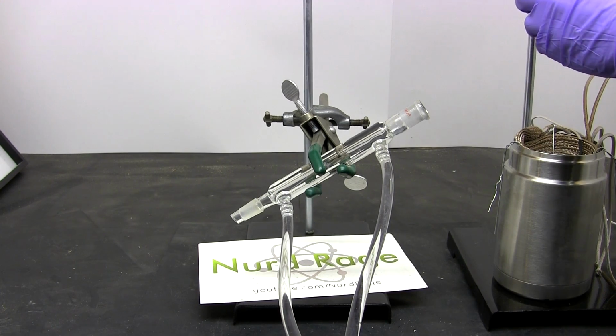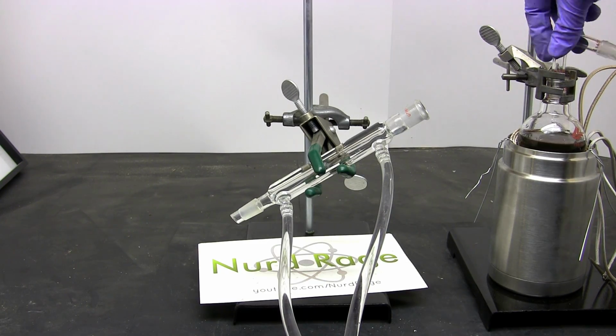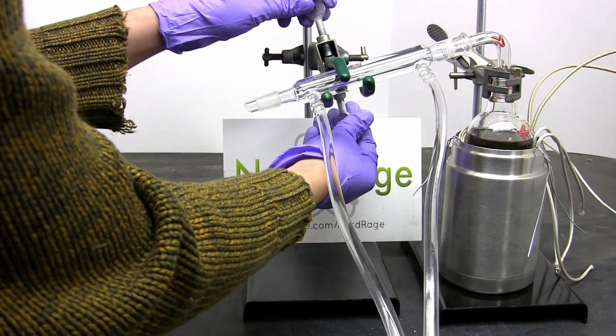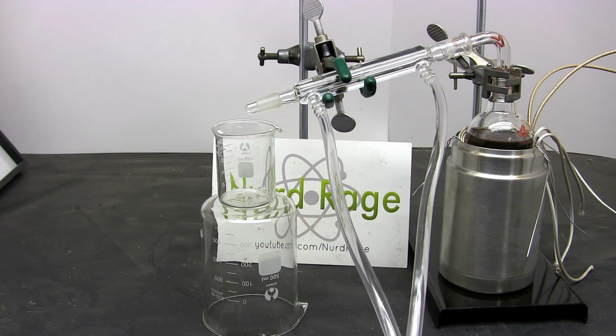Remember to clamp it to the stand so there is no chance it will fall over and spill. Now we connect it to the condenser using an elbow joint coated in high temperature grease. At the other end here, we put some beakers to receive our distillate. And we're ready to start distilling.